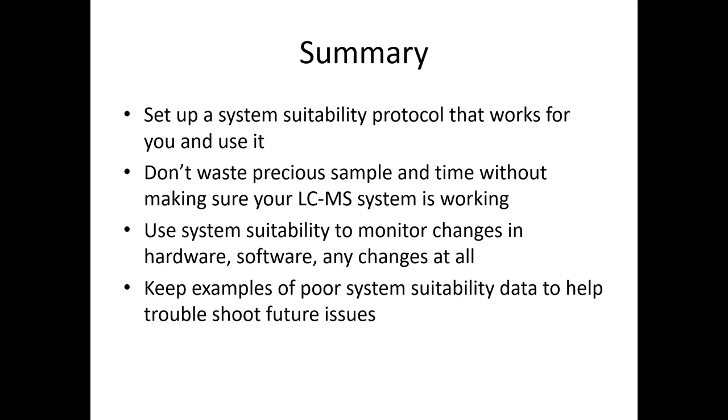The recommendation for some of the true nanoflow pumps is to change them weekly. And I was like, who has time for that? And now I do, because I had too many instances where I was getting irreproducible retention. Not only do I change them, but I make them fresh and I sonicate them to degas them, and then I change my solvents and I don't top off anymore. And I had enough engineers like, Sue, we can't come in and fix your stuff anymore. You have to do this because you're a Thermo employee. So listen to what they say, because it can help prevent future downtime.